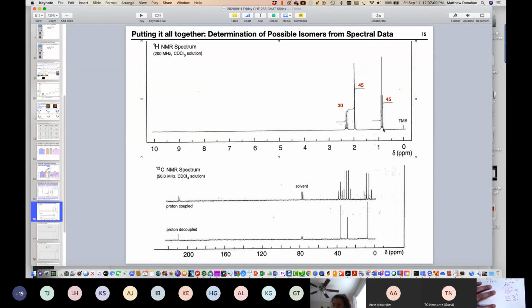Does that make sense? I know that was sort of a crash course in interpreting proton NMR, and again, we're going to go through this in more screencast and chat sessions. But really what we're trying to do is make sense of how we can look at a structure, think about uniqueness, and then assign it to actual data.